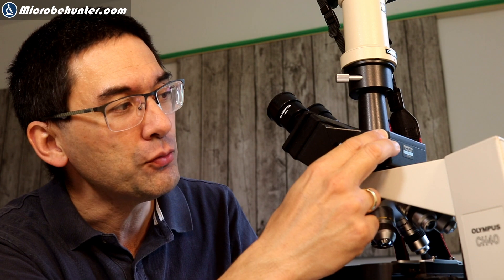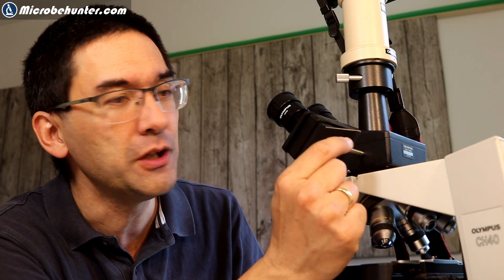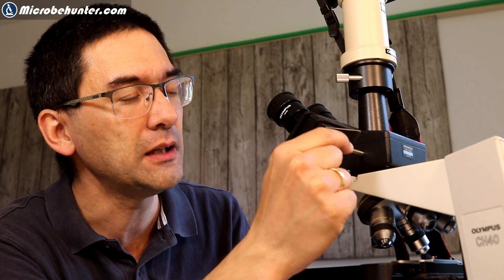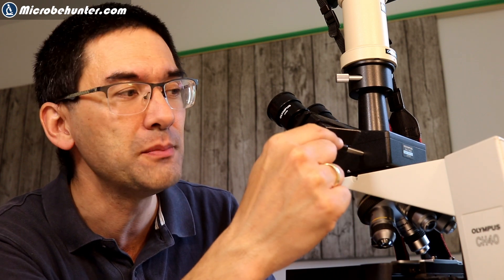Thank you for the question. I think you don't have to worry too much about which one of those two is better. But let me first explain a little bit what it actually means. What many microscopes with a photo tube have is they have a lever here, you can actually see here, which can be pushed in and pulled out. And this kind of redirects a mirror or a prism inside.